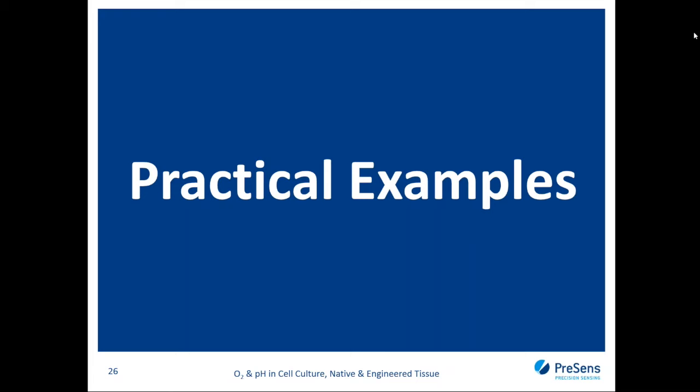You can define the interval from seconds to hours, and you can also make time series over seconds, minutes, hours, days, or some people also do time series over weeks. Then they choose bigger intervals. The total number of measurements depends a little bit on the RAM of your computer, but it's way more than 200. Okay. There is another question, related to the biocompatibility, which you mentioned earlier.